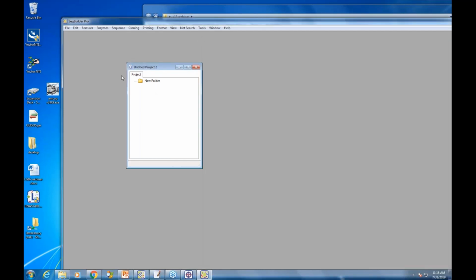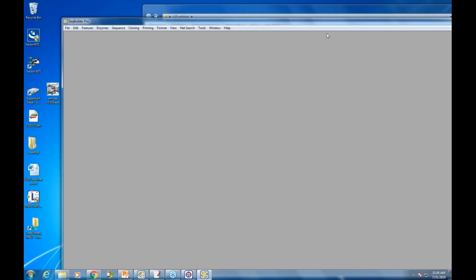They're called OA files, oligo archive, or DNA archive files. If you have those kind of files, you can drag and drop them into this new folder. So we didn't remove that older way to do things. If you do have archive files, you will be able to just drag them into this project file and then export them back out.